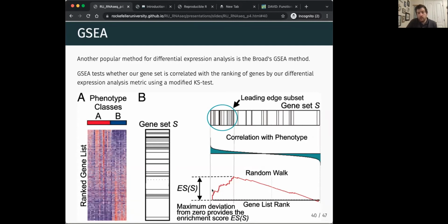And so the way that this works is you have your ranked list on this XY, and every time it does this random walk, it will start at this left-hand side, and there is this 0 value here, this black line.